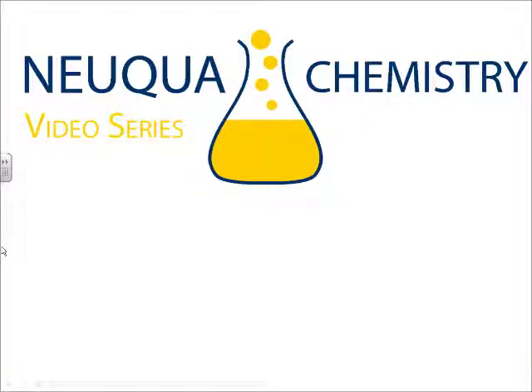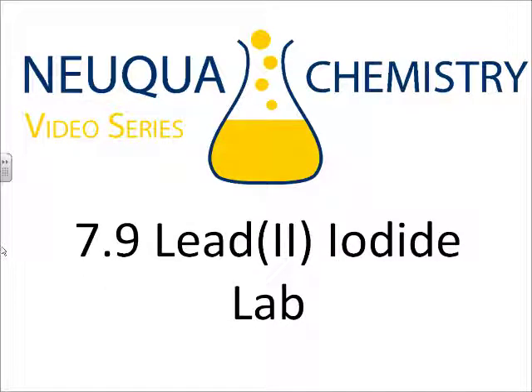Hi chemistry students. Today we're going to be talking about the lead-2 iodide lab. For this lab, what we're going to look at is, first of all, what's the reaction, how do we do the limiting reactants problem associated with it, and then take a look at some of the parts of the procedure that might be a little bit confusing.